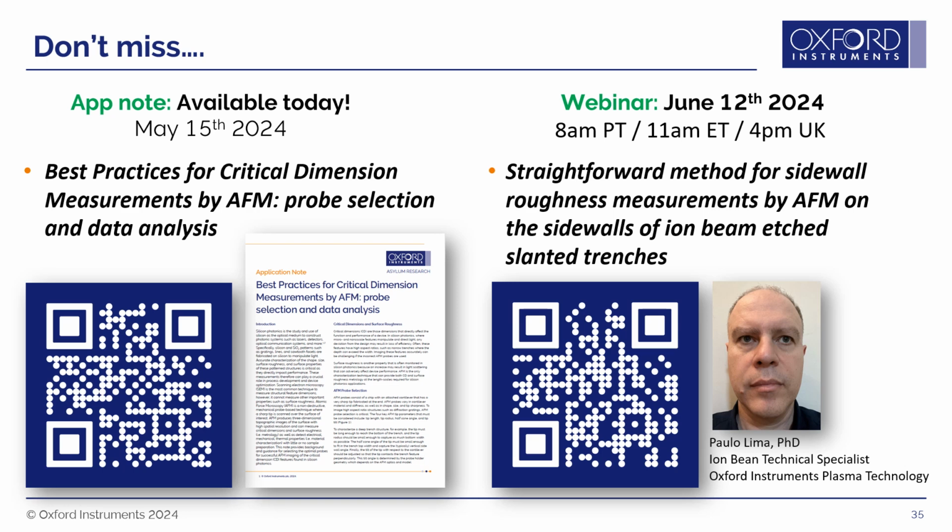Okay, next question. What is a typical surface roughness for silicon photonic surfaces, and what is the limit for AFM to measure roughness? So I'm maybe not the expert on all things photonics, but from what you've seen in the presentation, these are the roughnesses that I saw on these specific samples, which, if I remember, were below a nanometer.